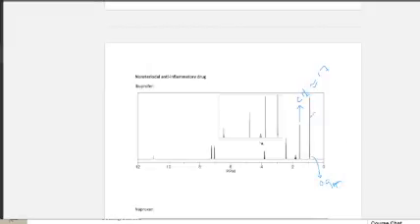In this case of the CH3 bond, we would have an integration of 3H because of the CH3. All right, so then again, this is the same case in here. This is a doublet, but it would have an integration of 2H. However, if we move on, this with all these peaks right here is a multiplet, can be another CH bond based on its placement, which is around like 1.8 ppm.